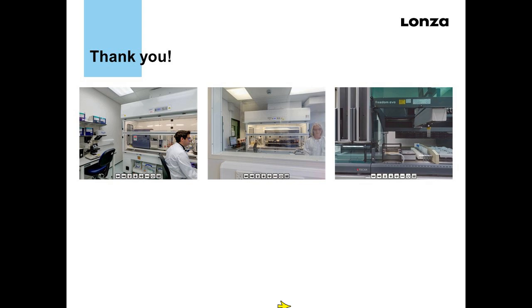Once the sample is prepared, instead of running on the traditional method what would have been a 2-hour gradient, we've now got a 45-minute gradient that can be used for glycans up to triantennary and tetraantennary screening, or we have a rapid gradient of 7.2 minutes if we're just looking at biantennary screening.